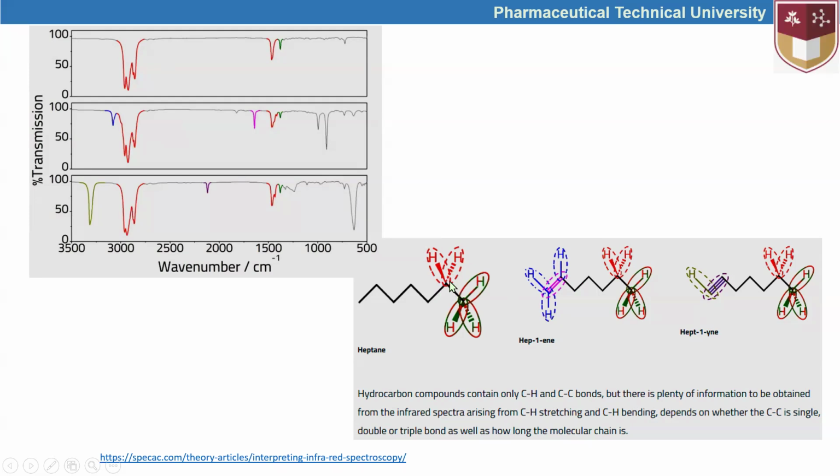Now what we have to understand is that since they have these similar bonds in all these three samples, we can witness their presence, based on some differences in the third sample as indicated here. Here we can see a few differences compared to this one, but the presence of those signals was kept.